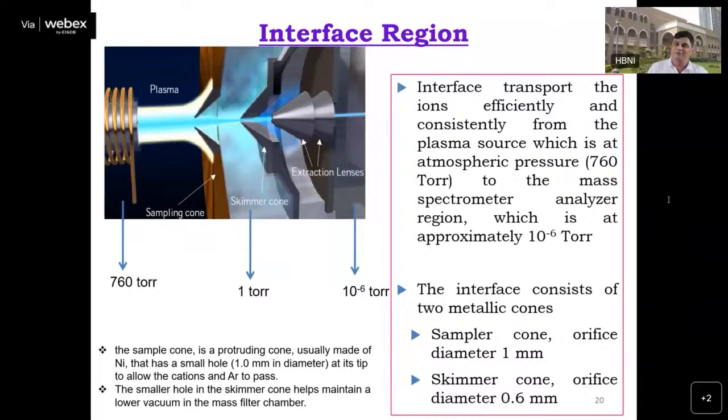But as I told you, my practical experience, I do not remember exactly what detection limit is given in the manual for the Activa ICP-OS. In our case, when we are doing some R&D work, for example, I have many papers published for the detection of uranium in groundwaters. In one of the works, we had gone up to a detection limit of 20 ppb by ICPOS.